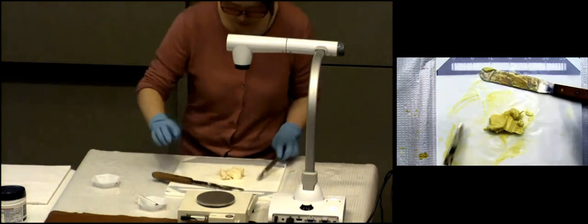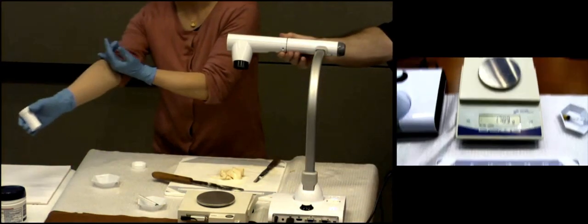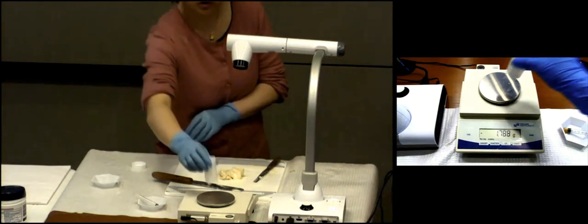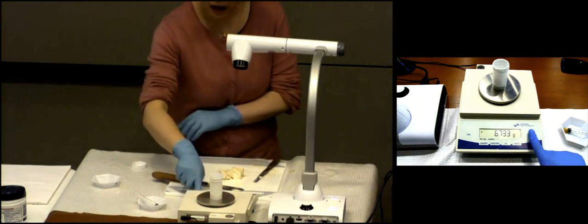Okay. All right, so here is the ointment jar. What is the weight I need to dispense? 30 grams. Great. So I have this 1 ounce bottle here. Perfect. 30 grams is roughly 1 ounce. I don't really need the weight of the bottle. Therefore, I need to tare with the bottle.